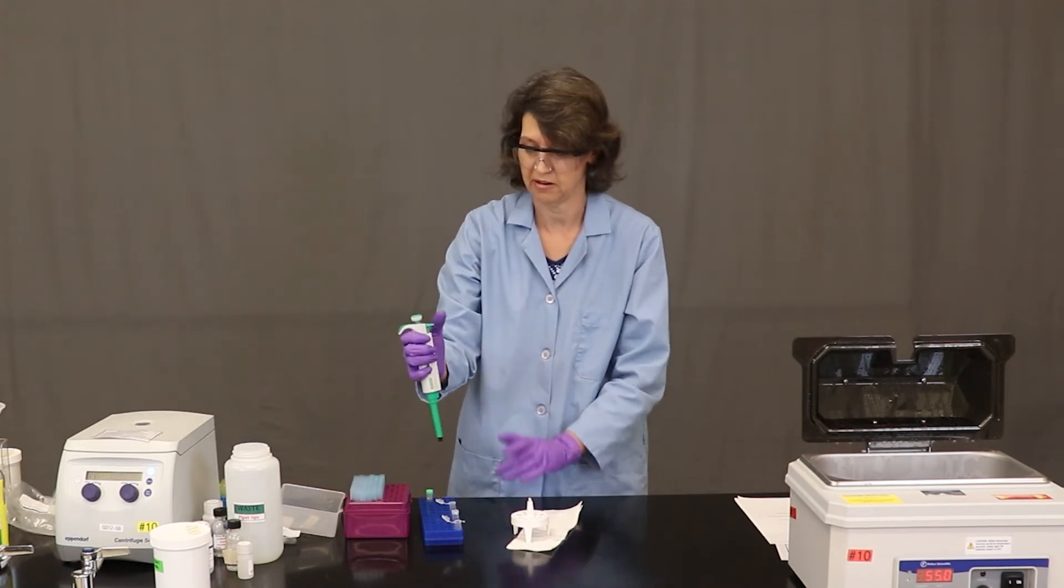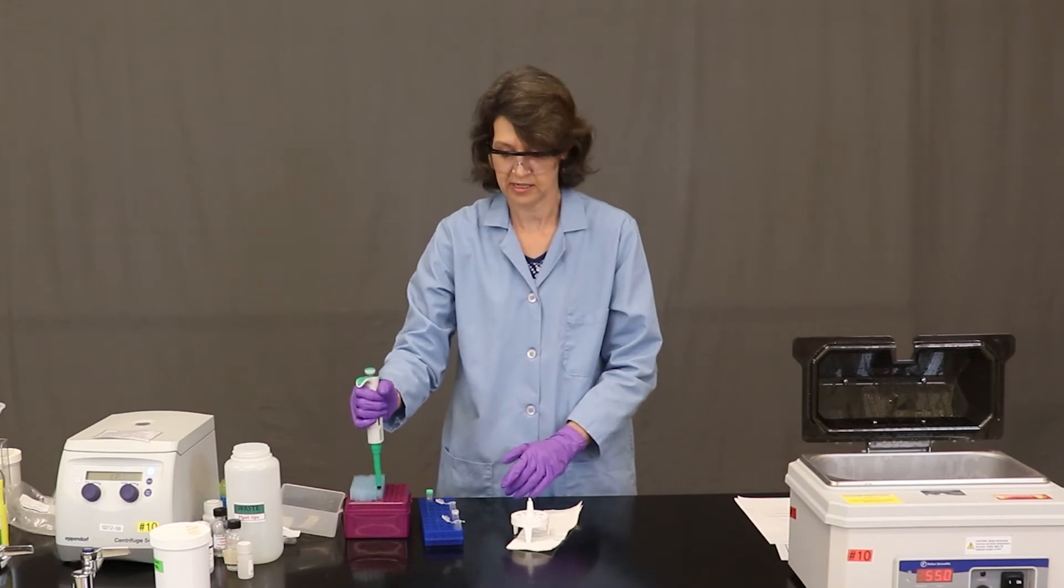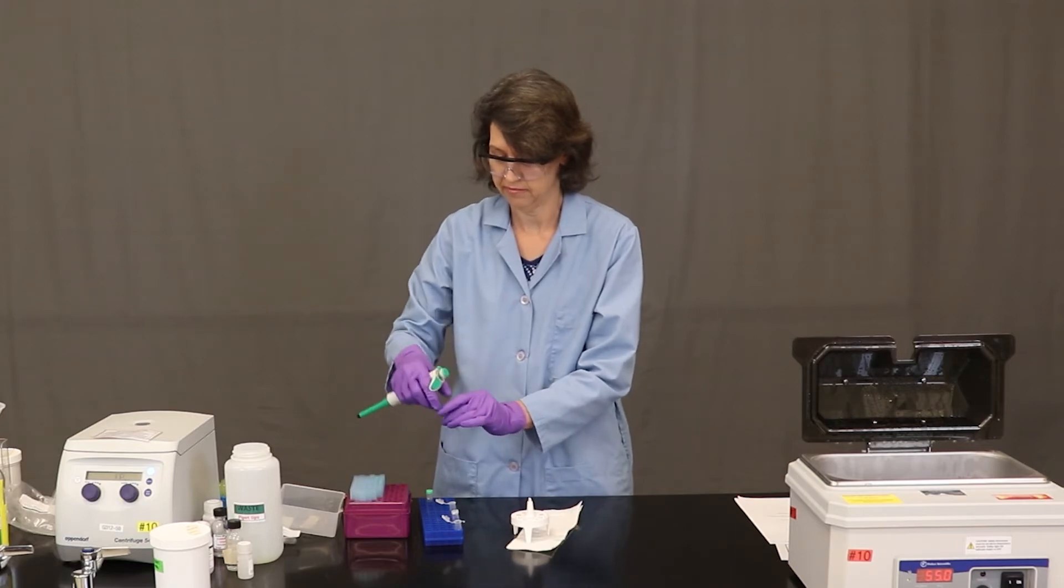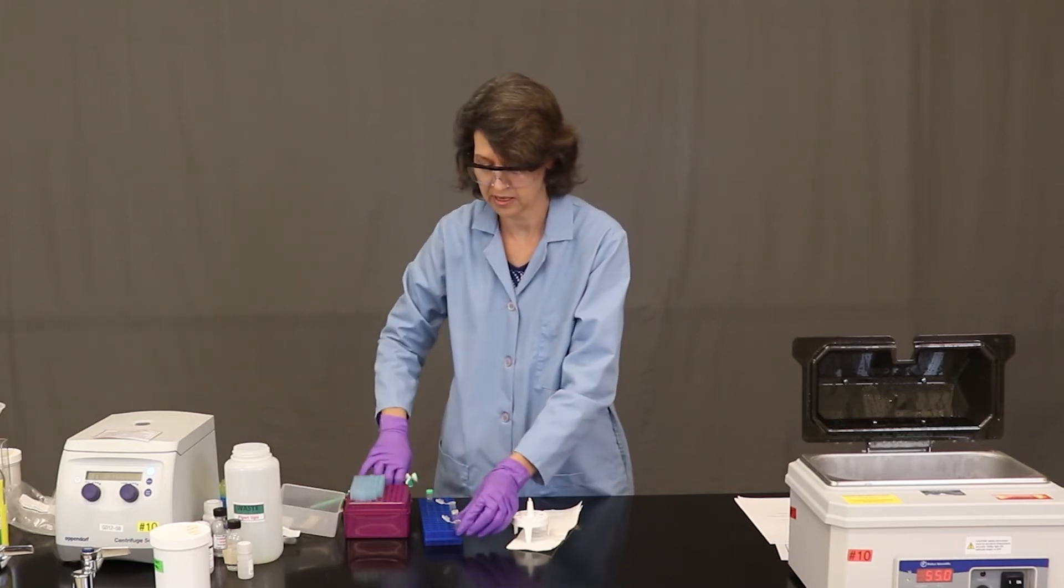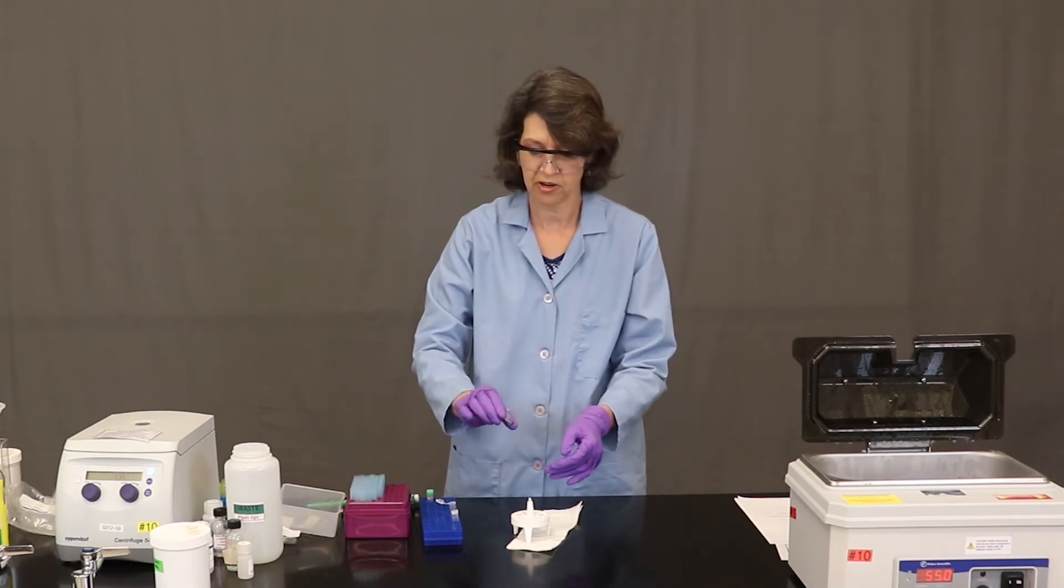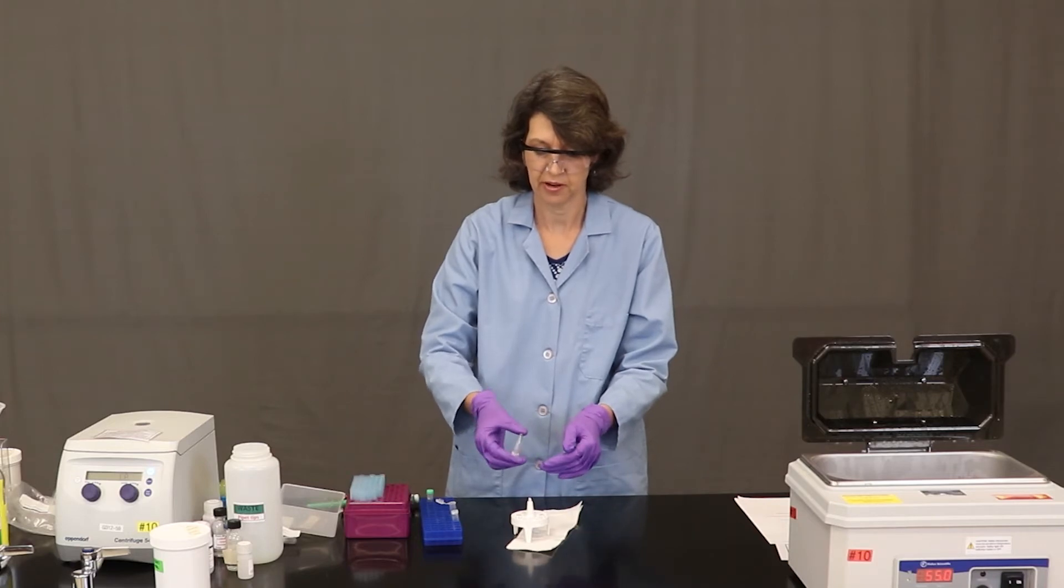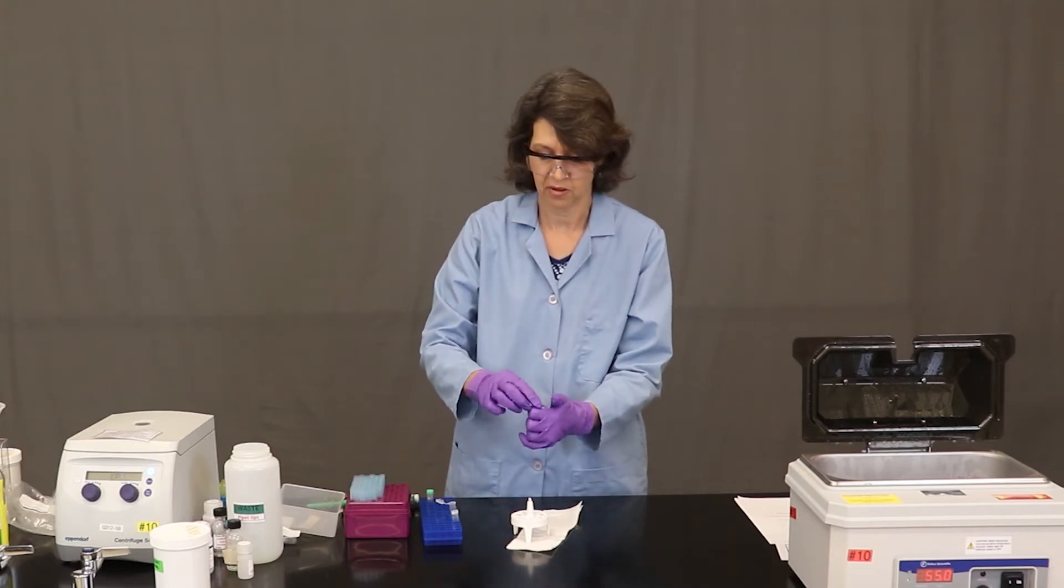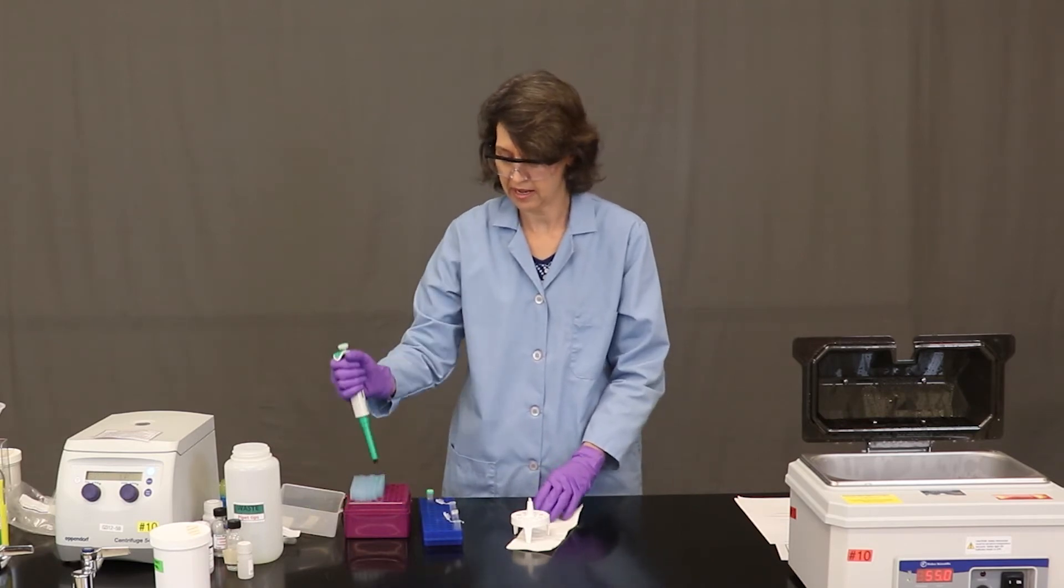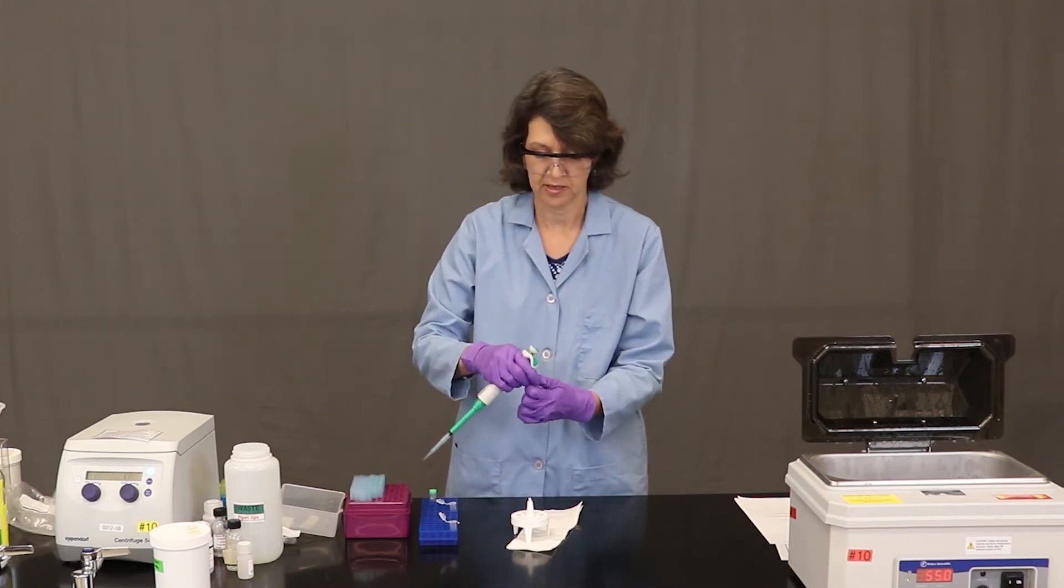And then I'm going to eject the tip in my tip waste container. So that's what that other button here does, is eject the tip. And you always want to change tips anytime you're using a different solution. So I need to mix this up. So I'm going to close the tube, just invert it gently a few times to mix the buffer in with the materials that were in there before. And now I'll go ahead and add the ethanol, which will precipitate the DNA.